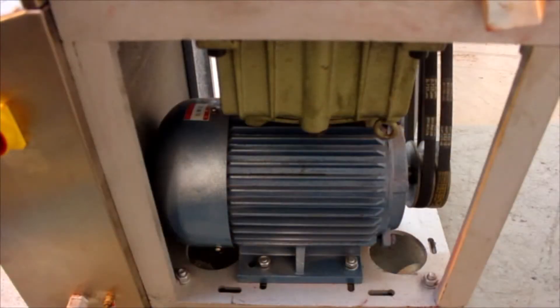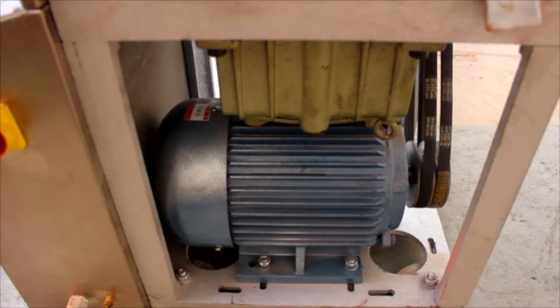This is a close up shot of the 1.5 kW motor that drives the RTP 5, 7 or 9. This is connected directly to the gearing that allows for large amounts of pressure to be achieved. The RTP 5, 7 or 9 can achieve a maximum of 40 kN of pressure. This is equivalent to approximately 4 tonnes.